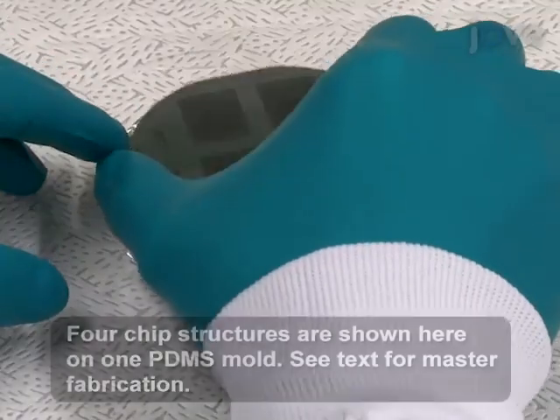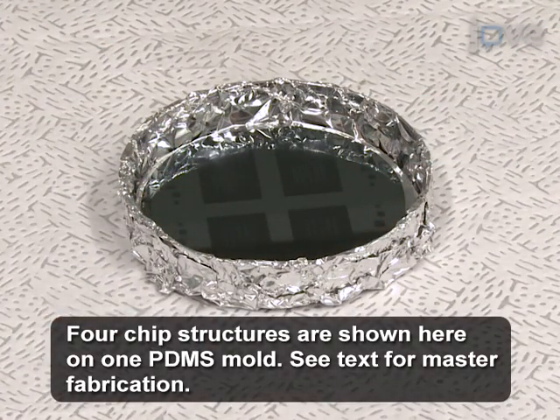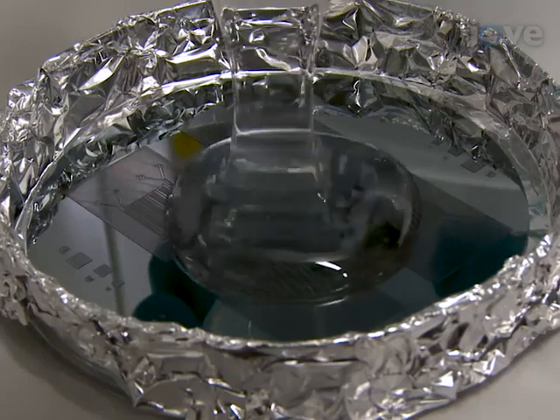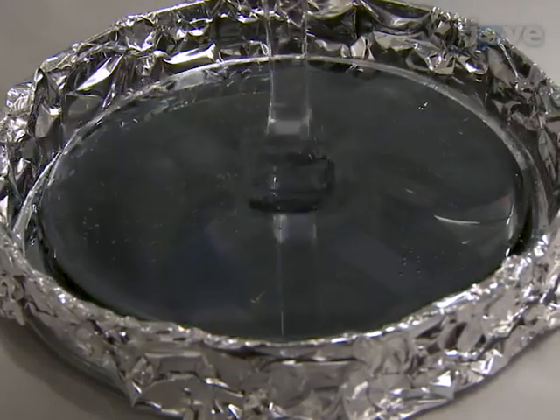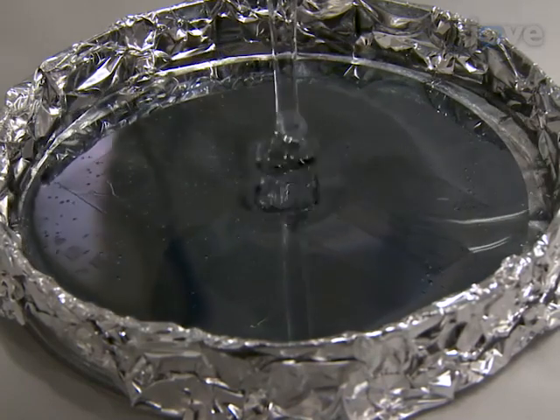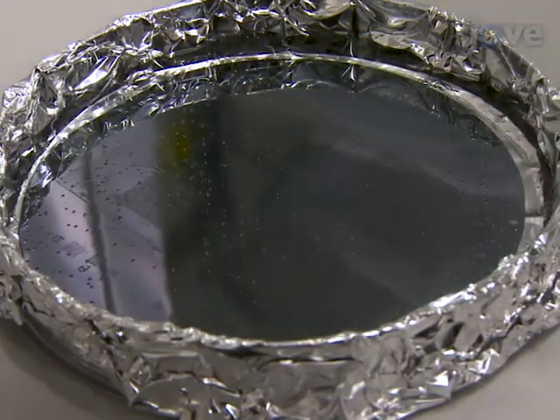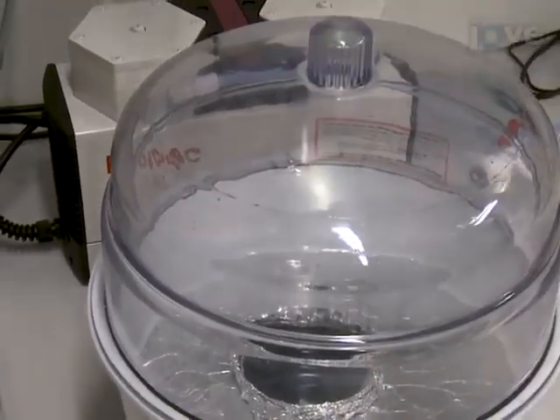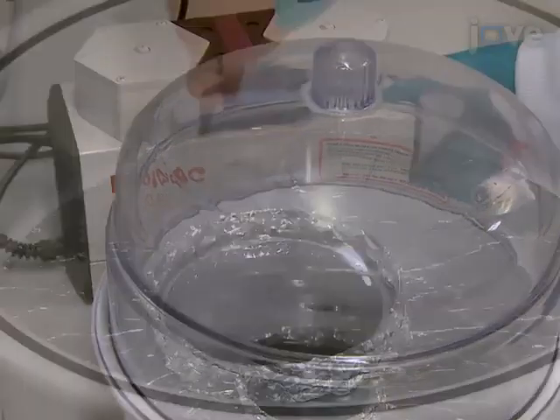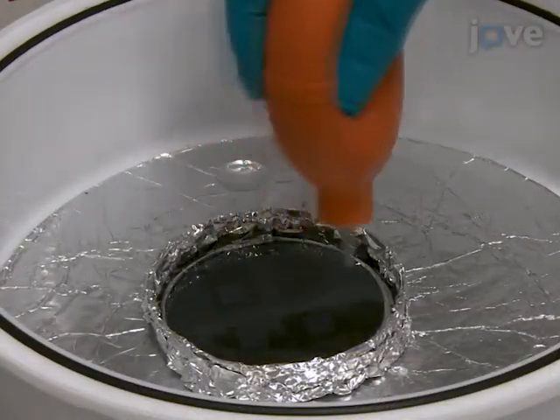First, place a master mold of the X-ray chip design in a 10 cm Petri dish lined with aluminum foil. Mix together about 30 grams total of PDMS base and curing agent in a 10 to 1 ratio, and pour the PDMS onto the master to a height of 4 mm. De-gas the PDMS in a vacuum desiccator for 5 minutes and blow air to remove remaining air bubbles on the surface of the PDMS.